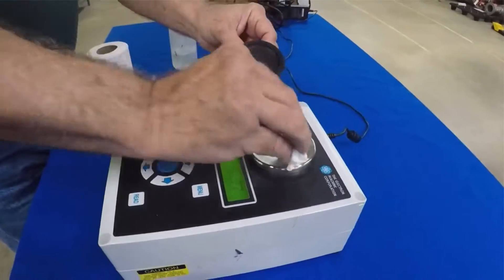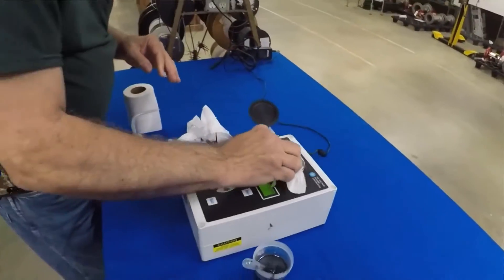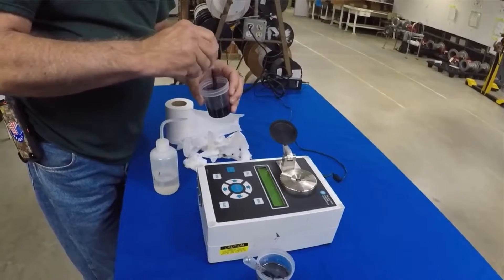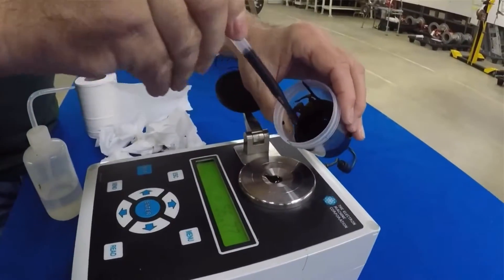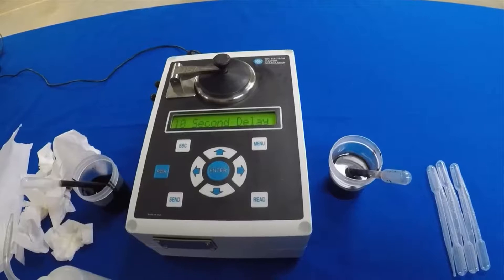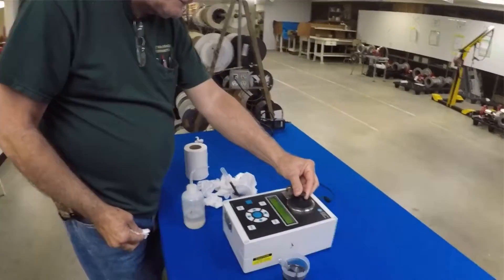With the heavy black liquor you do the same thing — use paper towels or toilet paper to clean it off. You can see that there's some discoloration, which means there's still liquor on there. We want to make sure that is all removed. Put the heavy black liquor on again — 56.69, within the margin. It doesn't matter who puts the sample on; it will still be the same.